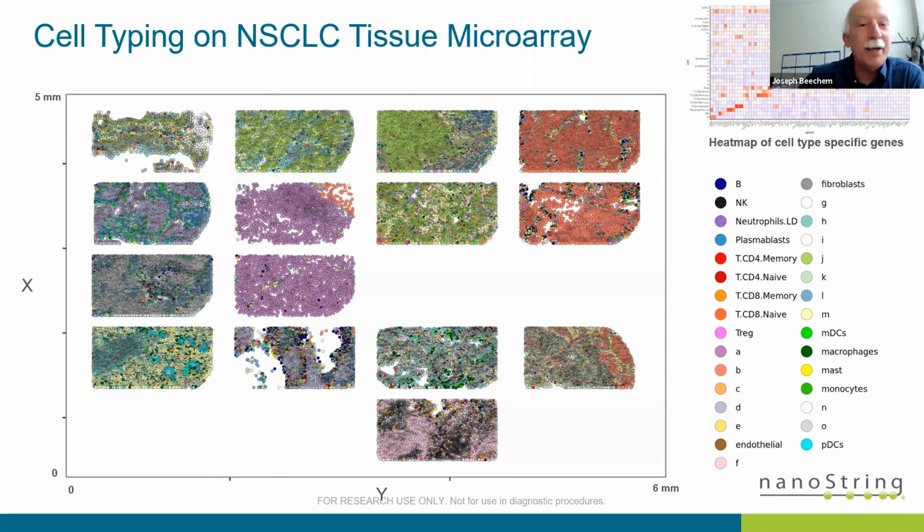We encode, all these methods are going to encode information. So in that respect, the encoding, there's a million ways to encode information. We have our own way of encoding in these really small particles. But the other thing is that we look at a very small footprint of the RNA that we are required to get.